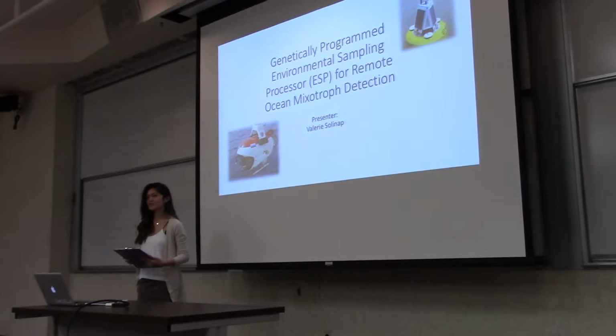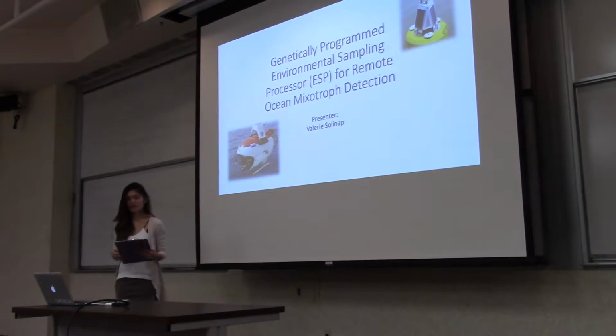Attending and allowing me to present to you what I've been working on. I've been working on a genetically programmed environmental sampling processor for remote ocean mixotroph detection.